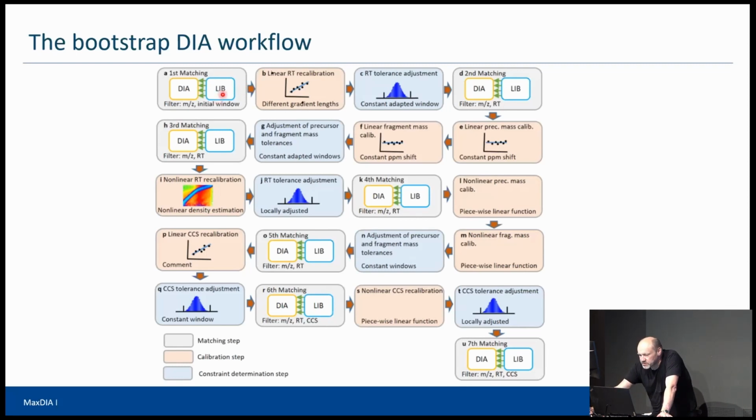And so how do we adjust it to the library? So first we start with a matching from the library spectra to the DIA sample. We will see later how exactly this matching works. That's also based then on a score again. But let's assume now we can do that. So we match the library to the one DIA sample that we're looking at the moment. And this is without any restrictions, so there's not even any retention time restriction. So we don't assume that you have the same retention time in library and in your DIA sample. Could be also completely different scale of retention time. And then based on these matches, so this is now done with the stringent score-based cutoff, so not really with FDR basically.